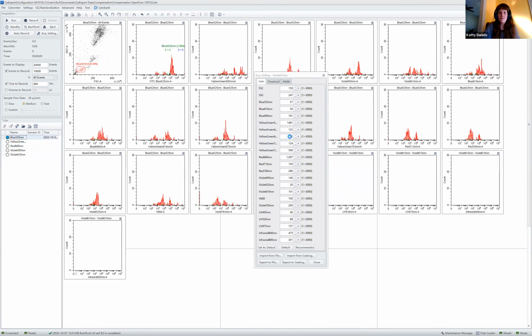So your eyes are pretty well trained to notice any minor differences. We would have seen any integers that had changed as I was clicking throughout that, which I did not see.